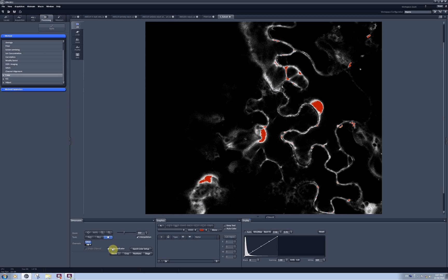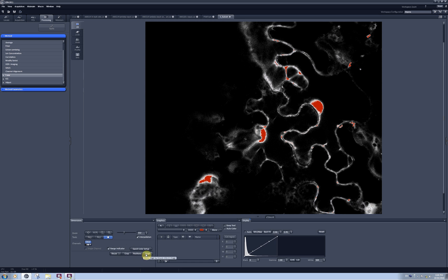A Range Indicator is also available here — it color codes the lowest zero-intensity pixels as blue and the top intensity pixels as red, with everything in between shown as gray scale. Quick Color Setup is useful when you have multiple channels and you want to quickly color them as Blue-Green-Red, Green-Blue-Red, Red-Green-Blue, all gray scale, or all in Range Indicator mode. These buttons are only useful when you are scanning.